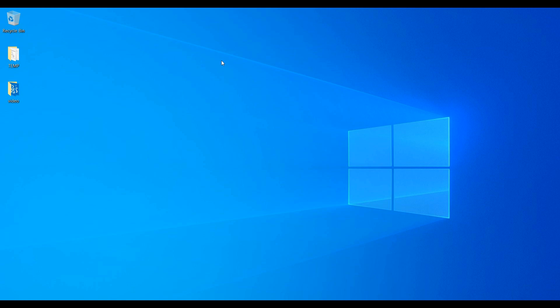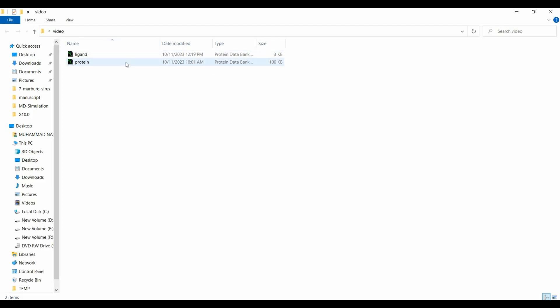Hello. In this video I will talk about molecular docking and molecular dynamics simulation performed for your data. Here I am using a protein and a ligand, but if you follow the same steps you will be able to perform this analysis for your own data.